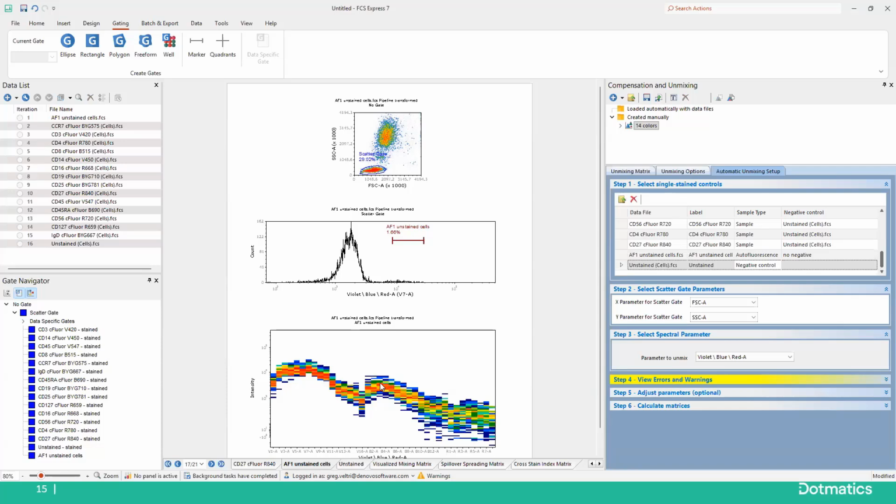So just be aware that when you're looking at autofluorescent populations, what you're looking for are different curve patterns, not the intensity difference. The intensity difference will be different for each one of these up here, but really it's the curve change. And I don't have any eosinophils, but eosinophils usually have a different spectral curve versus the rest of the peripheral blood that you would see here.